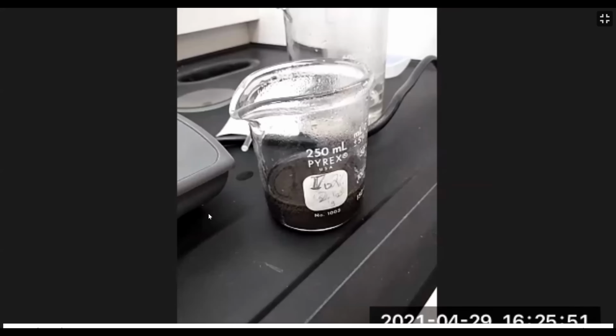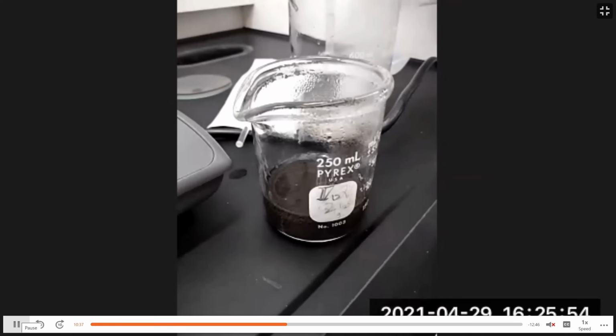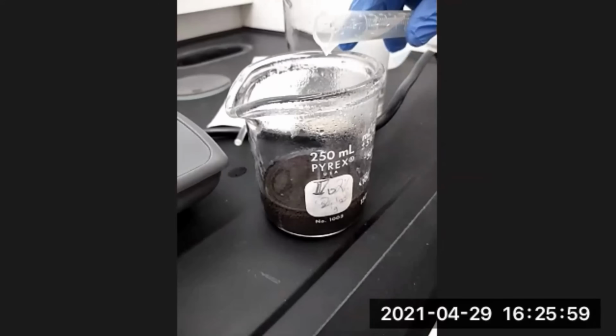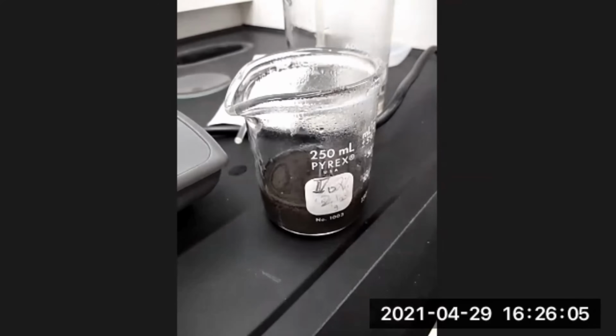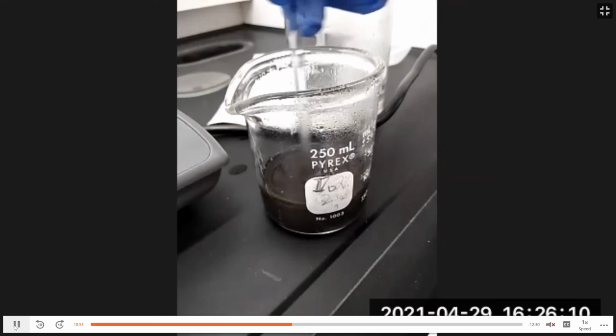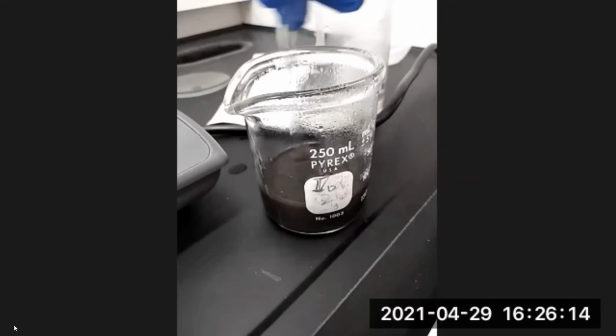So I fast forward, it was several minutes. It's a very long process to carefully remove as much solution as you can. But here we're near the end of this process of removing the solution. And now we're going to add the sulfuric acid. Here the sulfuric acid mixed with the copper 2 oxide is going to be our acid base reaction. So we should see the black precipitate react, and you're going to form a blue solution.